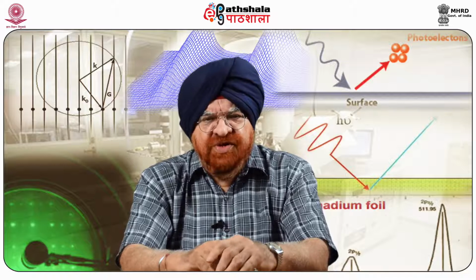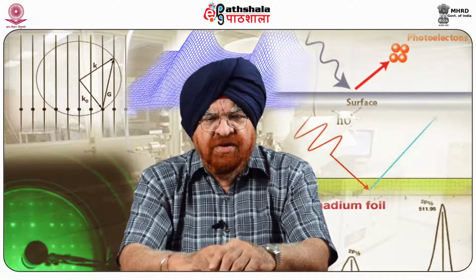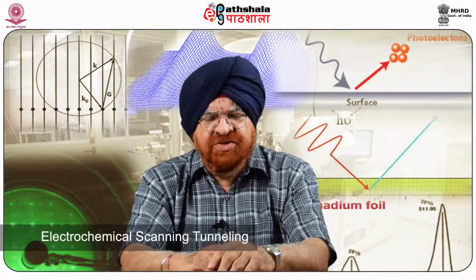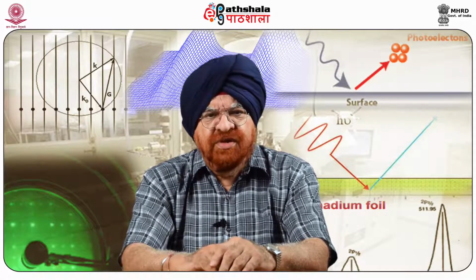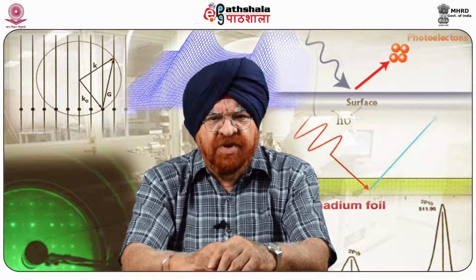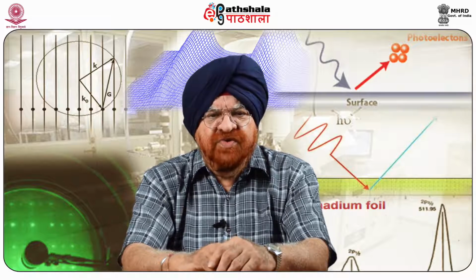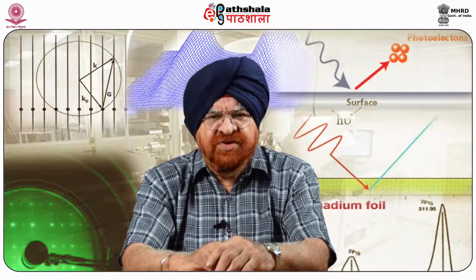Now, when we come to the first part, which talks about how we understand what it is, that is, in terms of definition, we know that the electrochemical scanning tunneling microscope, abbreviated as ECSTM, is a conceptual and instrumental extension of the scanning tunneling microscope towards its application to charged solid-liquid interfaces.